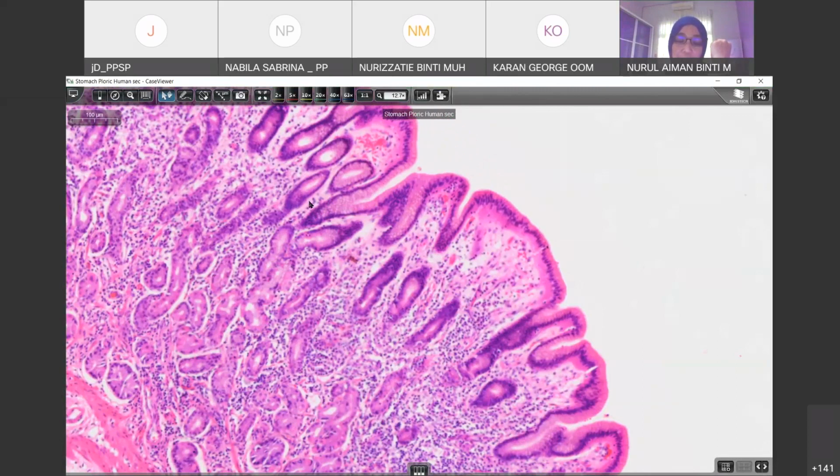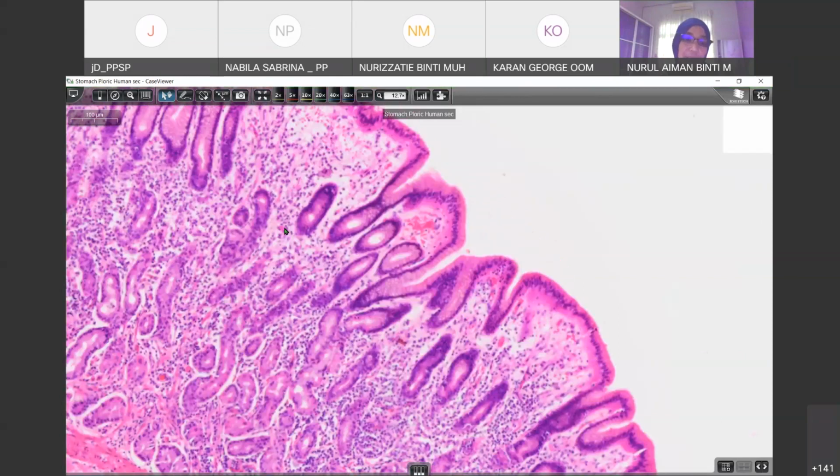This is the simple tubular gland that is present inside the stomach, because inside this gland there are a few types of cells that have certain functions. Some of them protect the stomach against acidity. Some of them secrete hydrochloric acid for the digestion of the food. It's complicated, but they have glands. Invagination of this epithelium towards the inside is known as the glands. So the pyloric glands of the stomach are a type of simple tubular gland. This is another one, simple tubular gland.